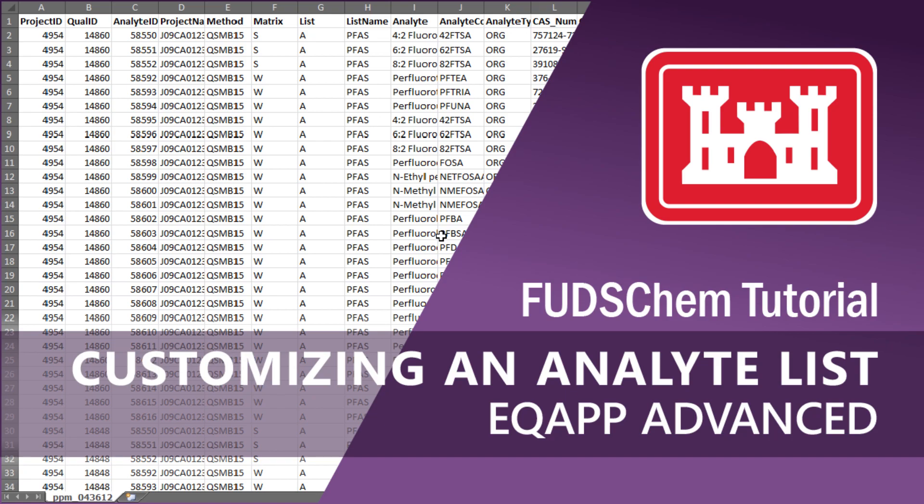This video is a more technical guide on updating the three final tabs of the EQAP once new analyte lists are added.